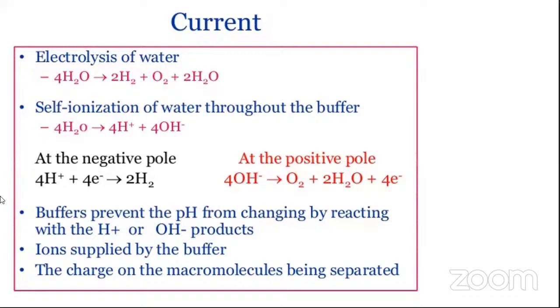These are all things that we have already discussed. Now, why I have shown it here again is because these are the charged entities which are going to be reaching the electrodes. Now, mind you, do you remember this? At the start itself, I told you that when we talk about electrophoresis, we don't allow the molecule which is moving under the effect of electric field to reach the electrode, right?